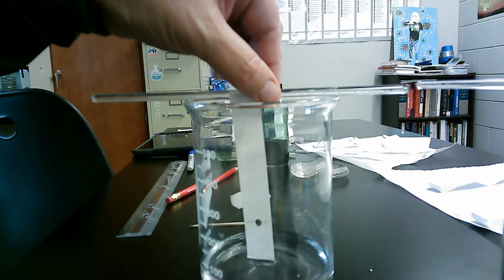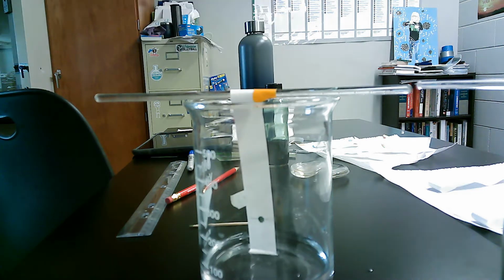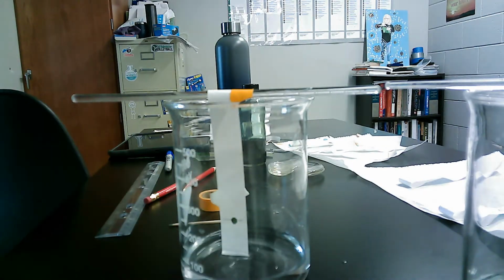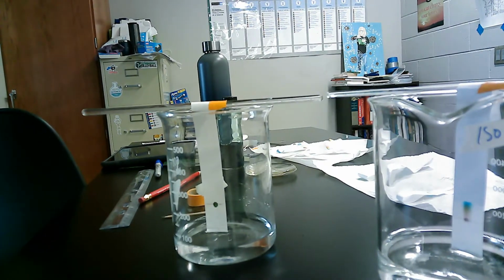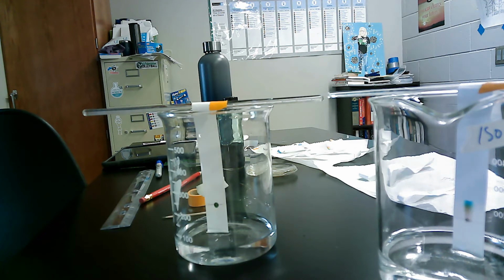That's why this is not professional. I can see where my solvent is traveling up. Now, those we're just going to let go for a while. So in class, we let those go until a certain time, and then we took them out. So I'm going to stop the video, let it go for a little bit, and then I'll turn it back on once it's progressed so you can see the progress.